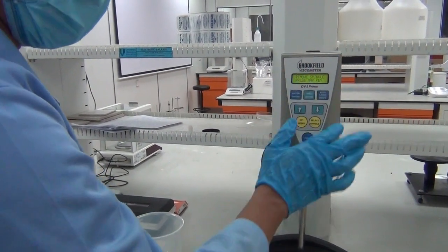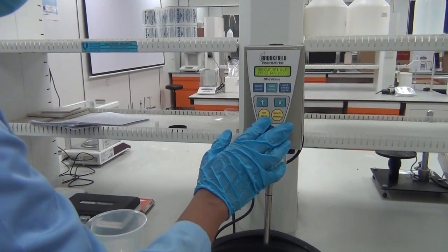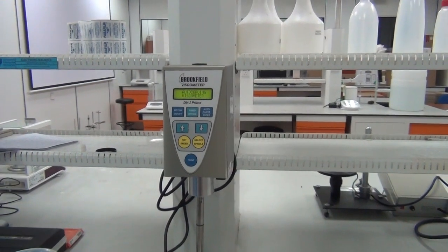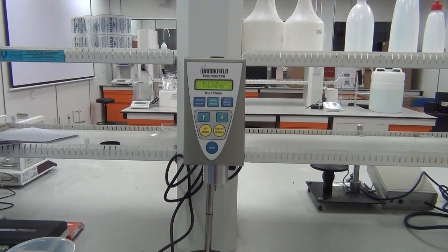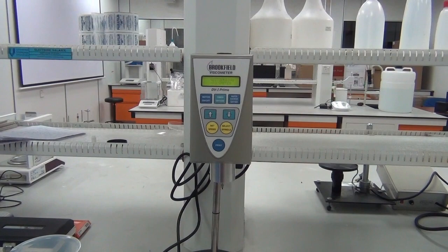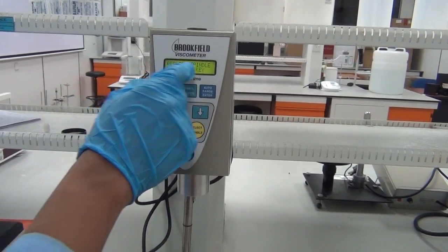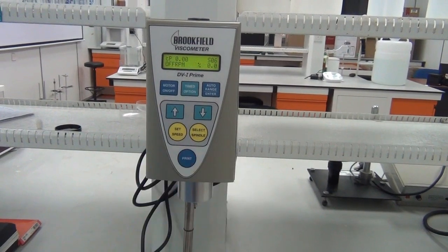You just press any key on the face of the Brookfield viscometer, until it turns into auto zeroing. Then again, make sure there is no spindle. It comes up with 'replace spindle' and press any key here.